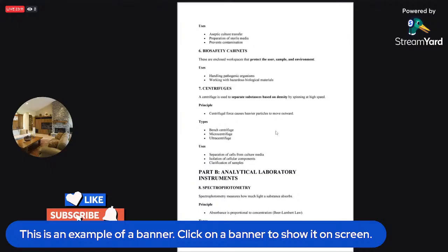So that's why when you collect a blood sample, if you really want to study the components of cells, you will subject them to higher centrifugal force so that all the components of the cell will be able to separate out based on their weight and their density. So there are three different types of centrifuge. Number one, we have bench centrifuge, we have microcentrifuge, and we have ultracentrifuge, depending on the sample and depending on the laboratory in which you are working.